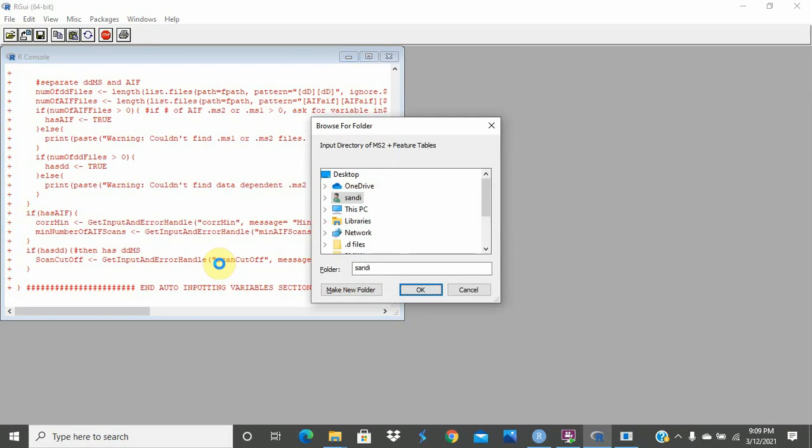Your progression in the program will take place through pop-up boxes, and it's important to know that sometimes these pop-up boxes appear behind the current window. If you're not seeing this pop-up box, simply minimize your current window and you'll find it. The first pop-up box for running the program will ask what folder contains the files to use. Now we will want to input the folder with the files desired. For the sake of this tutorial, I will do the single experiment folder.